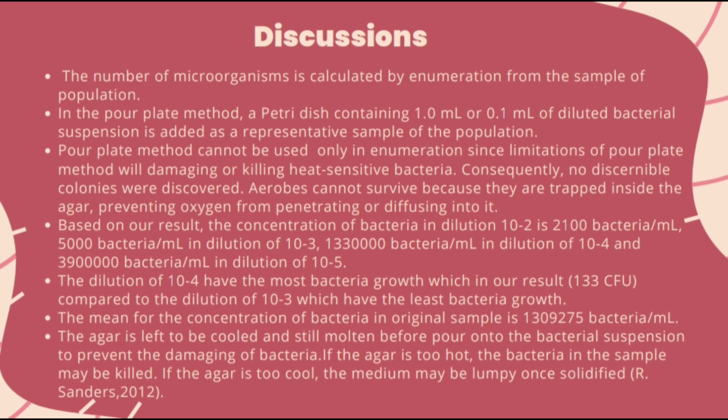Lastly, the agar is left to cool but still molten before being poured into the bacterial suspension to prevent damaging the bacteria. If the agar is too hot, the bacteria in the sample may be killed. If the agar is too cool, the medium may be lumpy once solidified.